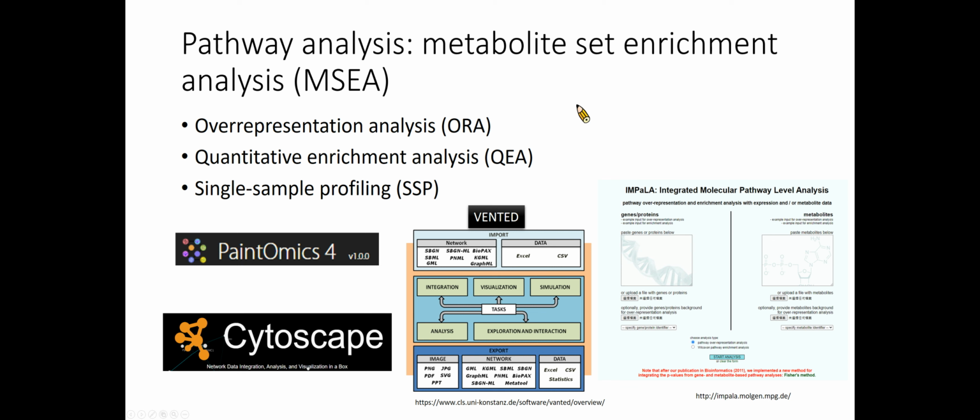In overrepresentation analysis, a hypergeometric test or a Fisher's exact test is used to evaluate whether the metabolites of these groups are represented more than expected by chance. When the input metabolite list is defined as the set of metabolites which are differentially expressed in the analyzed phenotypes, the ORA method may identify metabolic pathways that are globally associated to these phenotypes.